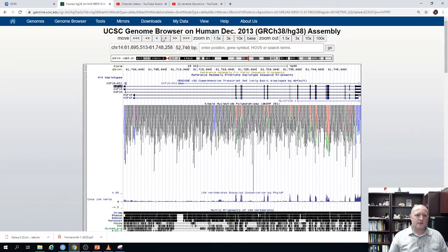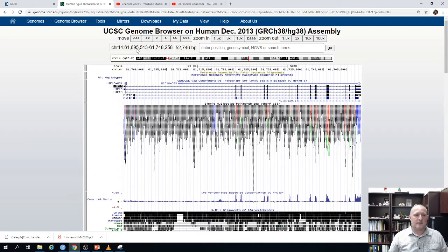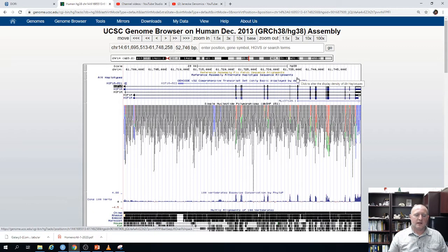You have little arrows where you can move back and forth and zoom in and out. Below that it shows the exact chromosome you're looking at and the base pair position. For example, we're looking at chromosome 14, between position 61,695,513 to 61,748,258 base pairs — a 52,746 base pair window. You can change where you're looking by entering a position, a gene symbol, or even a phenotype term.